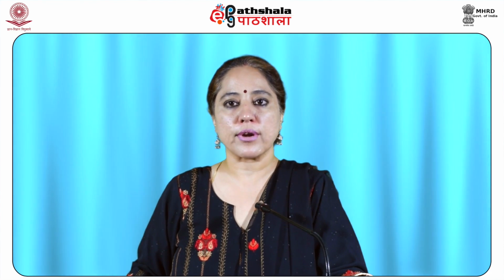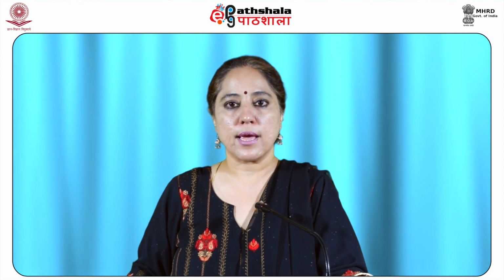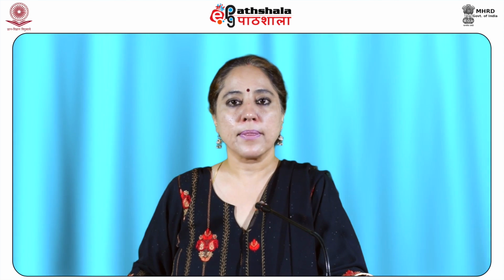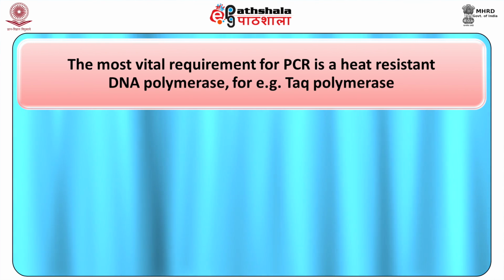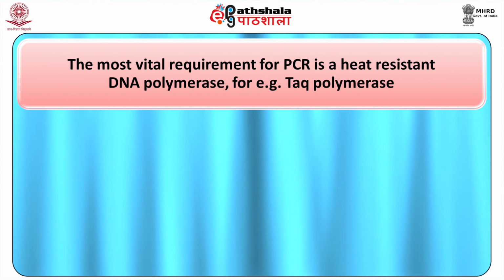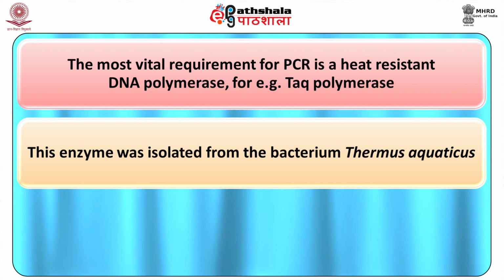As the PCR further progresses, the DNA synthesized is now used as a template strand for replication, thereby leading to a chain reaction that results in exponential intensification of the DNA template. A large number of genetic manipulations can be made by exclusively modifying PCR. The most vital requirement for PCR is a heat resistant DNA polymerase, for example, the Taq polymerase. This enzyme was isolated from the bacterium Thermus aquaticus.